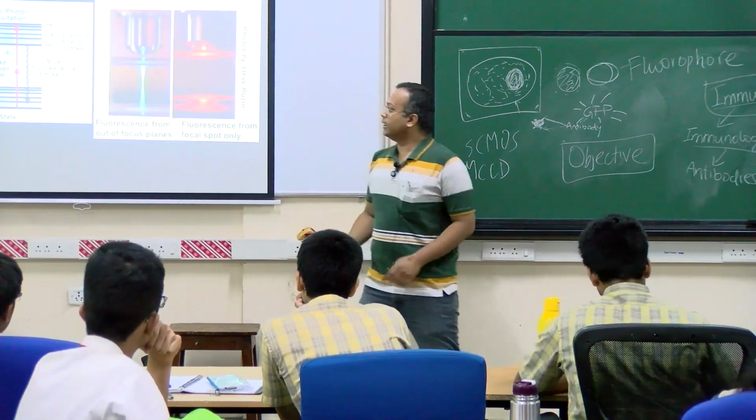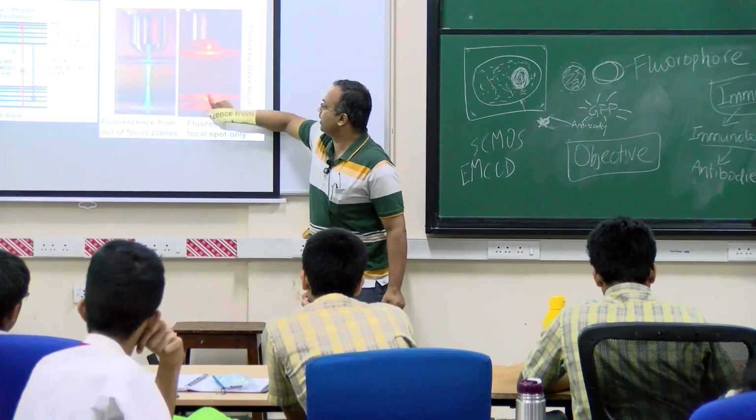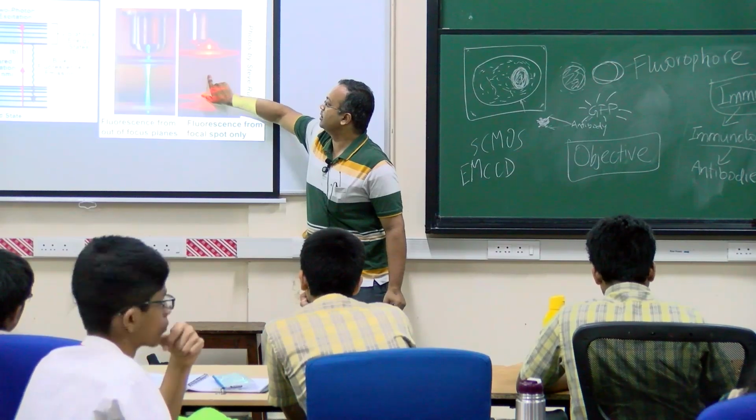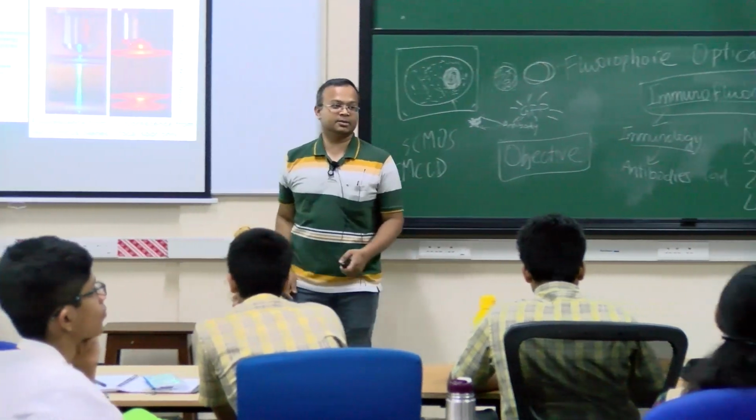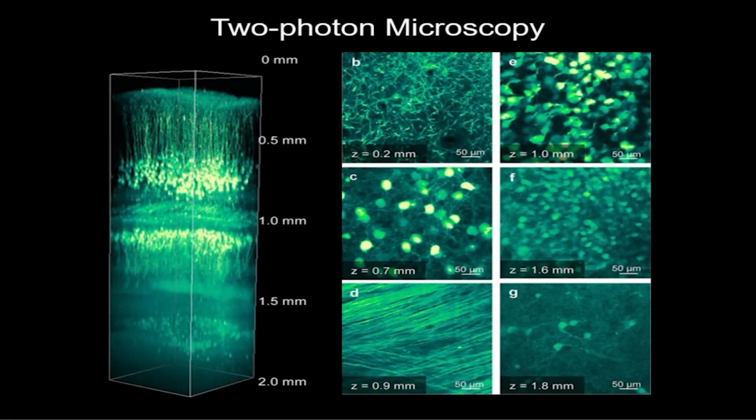So if your sample is this thick, you can guide this spot of light one at a time, and you can image one at a time all of this. So you can reconstruct this, and this is useful for imaging deep tissue.